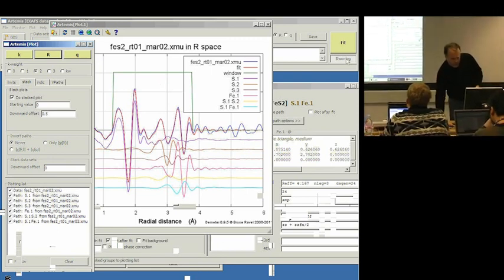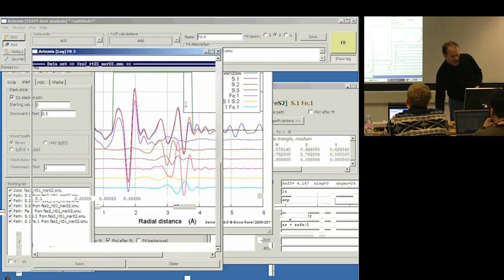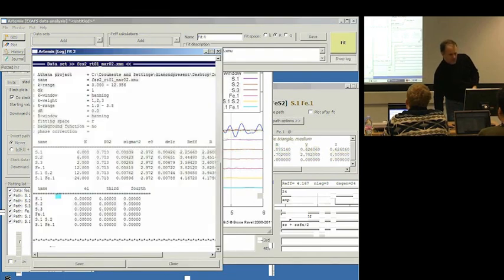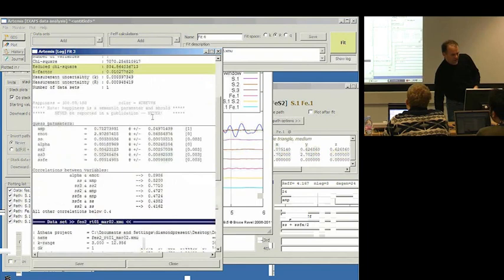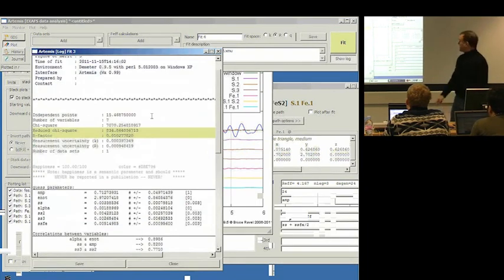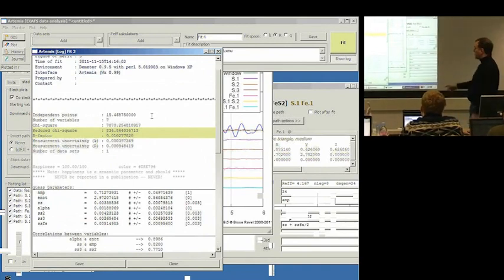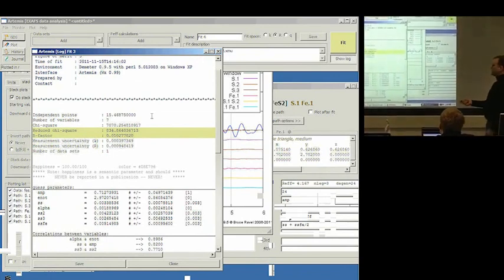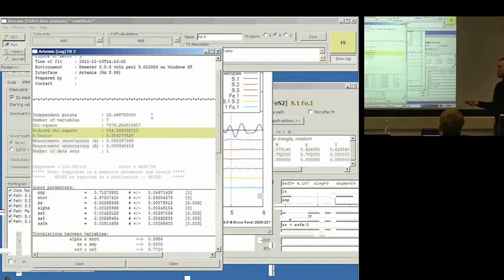Of course, it's not enough to just say that. It's not enough to just say that the red line looks like the blue line. We have to evaluate the parameters, and we see a consistent, if small, march towards reasonability in the amplitude parameter. It's a bit bigger. It's starting to get into the range that we expect.